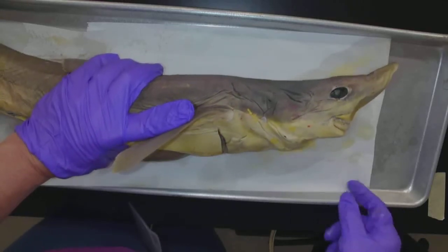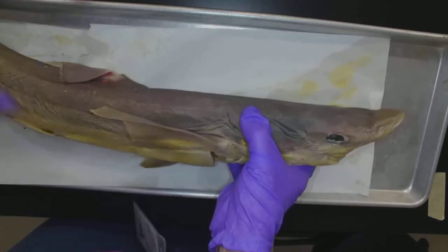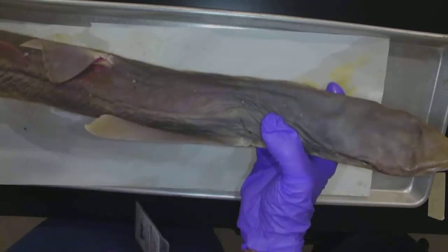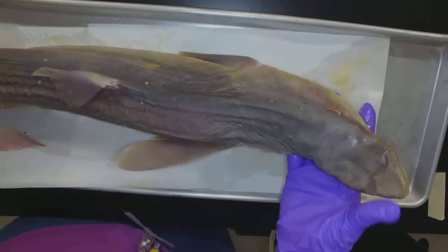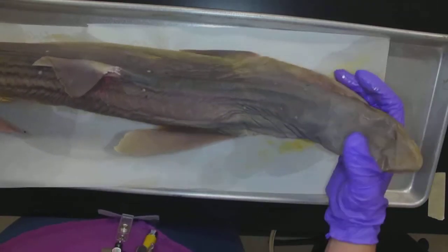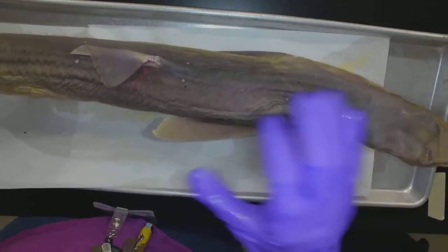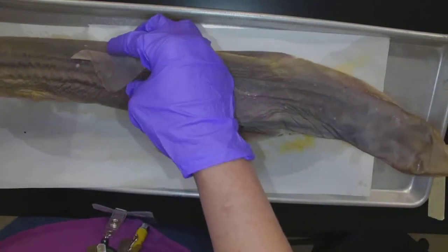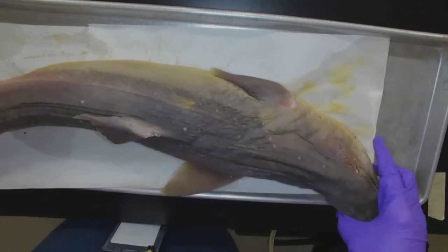Here we are with the dogfish, Chondrichthyes. This is a type of shark. He does not look the most beautiful as he did in life, because he has been preserved so that we can look at him and learn from him. They're much neater in life, but we can still see all the structures, and that's what this is all about.